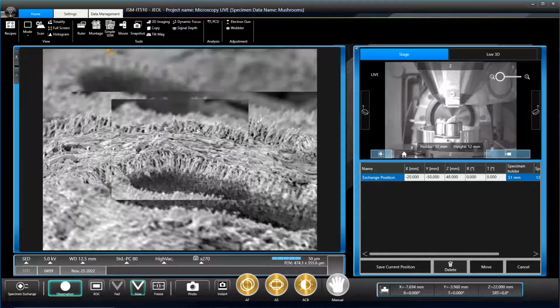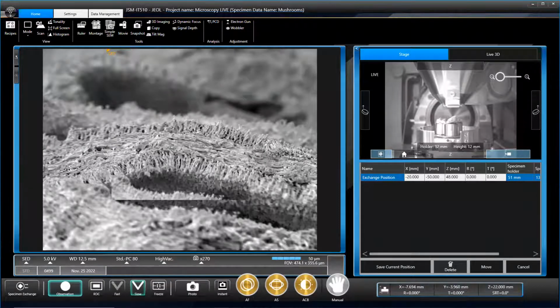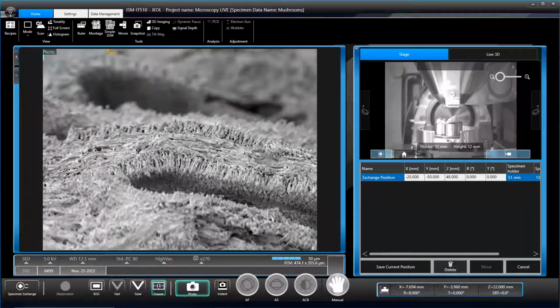We've done some field work on Dartmoor. We've collected magic and non-magic mushrooms. I'm using a technique called NGS Illumina sequencing, where I'm pulling out the insect DNA that's been associated with or within the mushroom caps, to see which insects are associated with magic and non-magic fungi. I guess we're predicting to see a lack of insects associated with magic fungi if our hypothesis is correct.